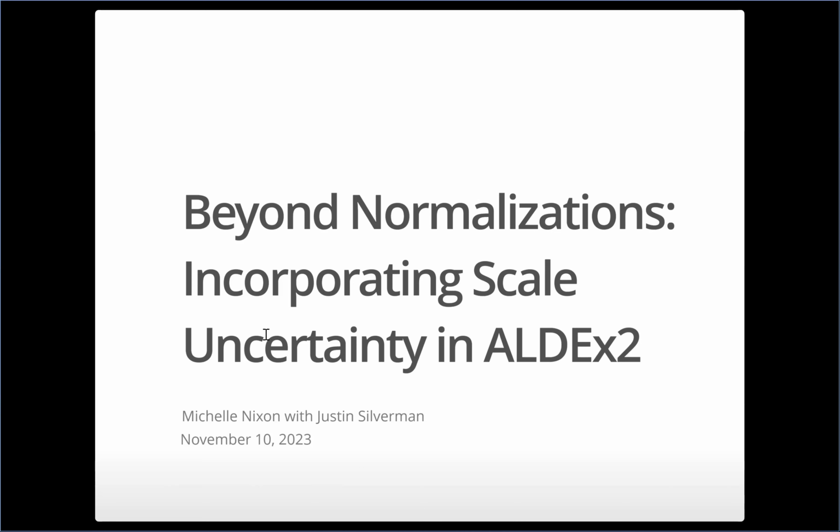So the whole point of the talk today is to discuss some of the recent changes that we've made to the ALDEx2 software suite. And basically these changes step away from normalizations. And I'll discuss what I mean exactly by normalizations later. But in stepping away from normalizations, we can include more informative models about the scale or the abundance of our taxa when we're analyzing our count data, our OTU or our SV table type data.